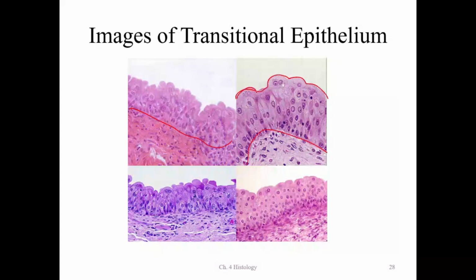And it's got that classic tombstone appearance for transitional. It looks like tombstones. All right. Very good. I hope that helps.